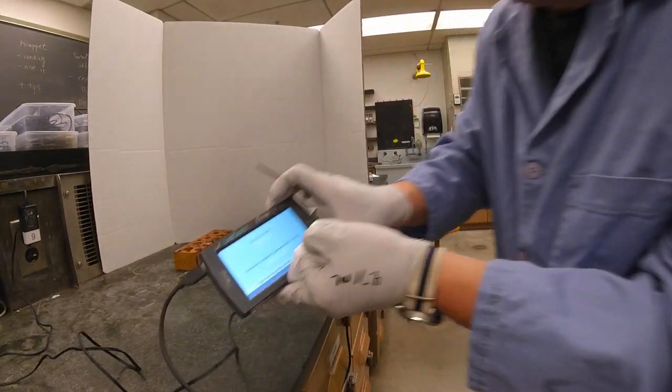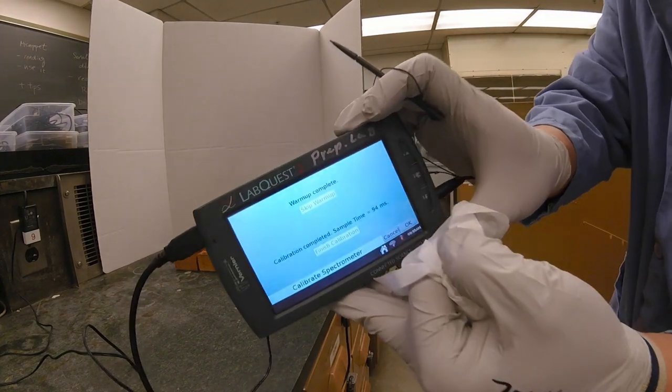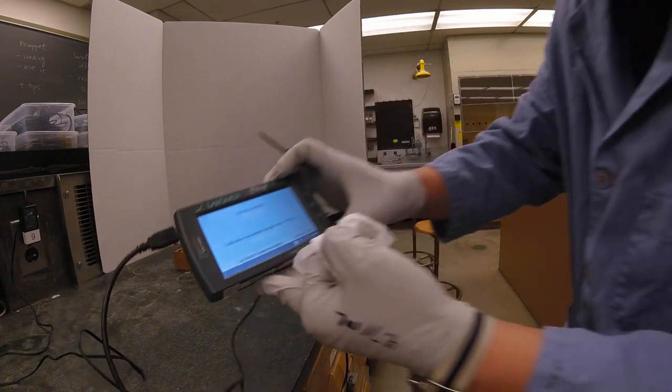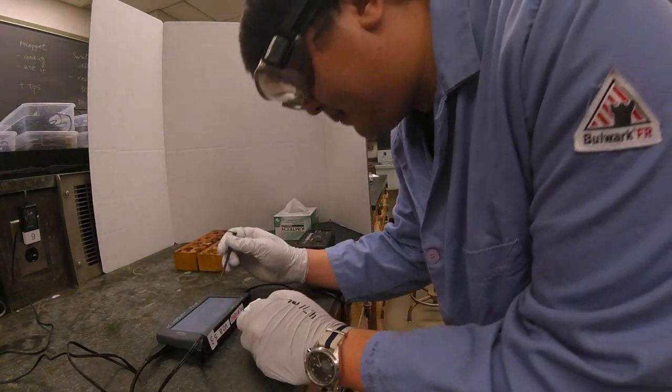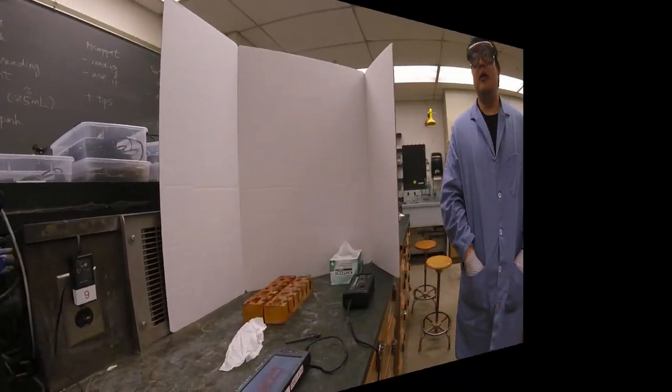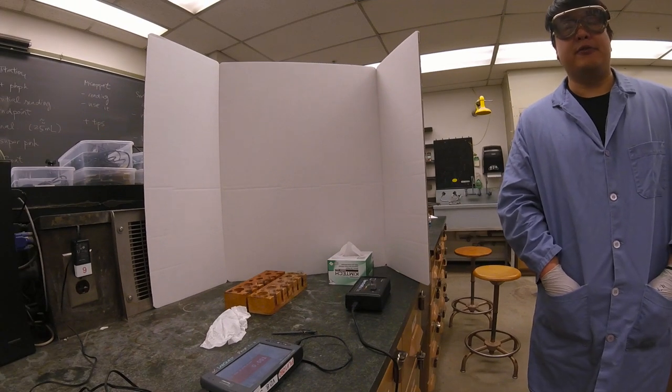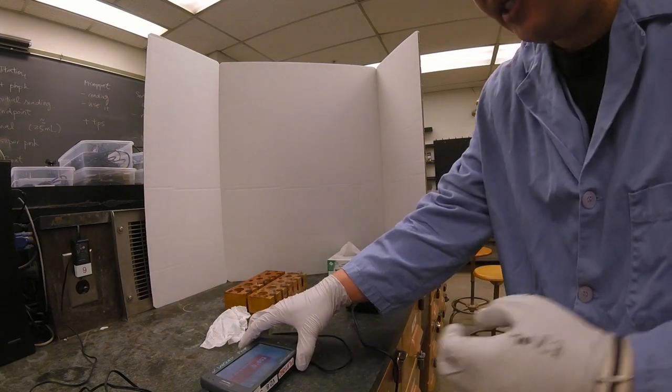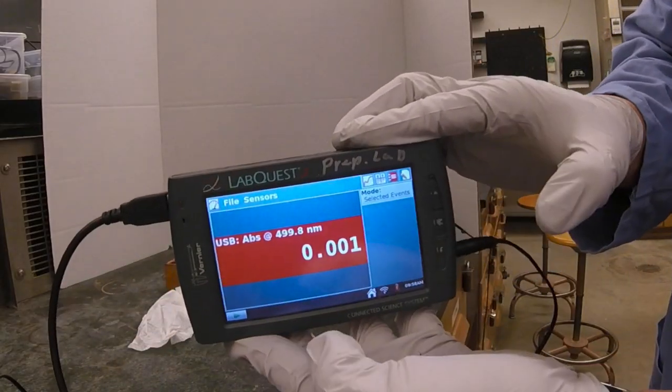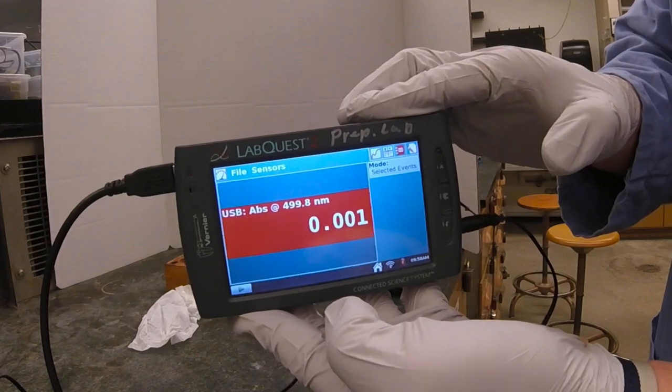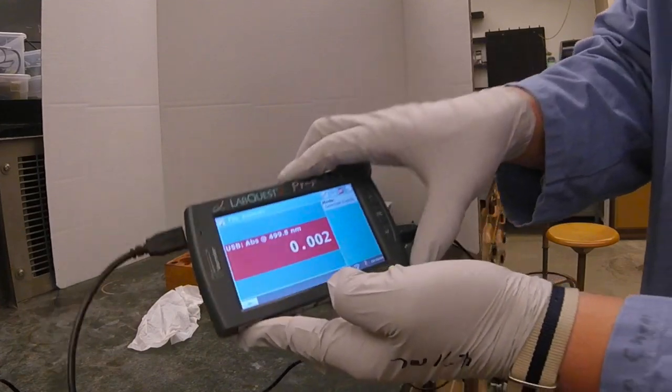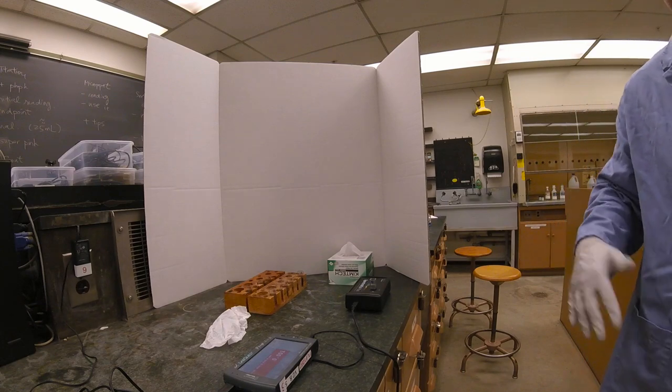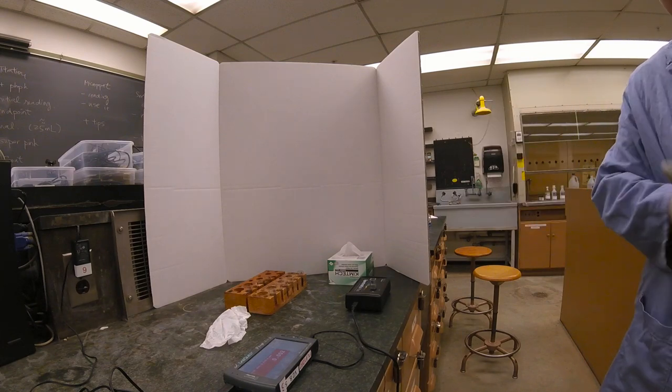Once you see this screen after hitting a couple buttons, the calibration is done. After the blank, I calibrated the machine. As you can see, the reading should be very close to zero. If it's fluctuating within this small range, it's okay—the reasons are due to instrument vibrations and shadows moving in the light. At this point, we are ready to go.